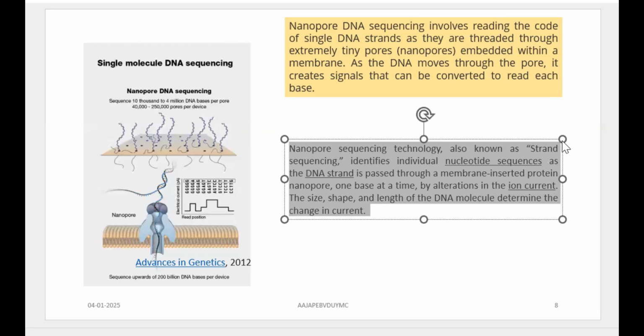Of course, that is what actually happens in the host also, right? It gets inserted into the bilipid membrane of the host, and as a result, osmotic disruption of the cell occurs and cell lysis. So the pore of the hemolysin, staphylococcal hemolysin, is the alpha HL pore. It is a heptamer having 7 units, and it has about a 2.6 nanometer transmembrane channel.